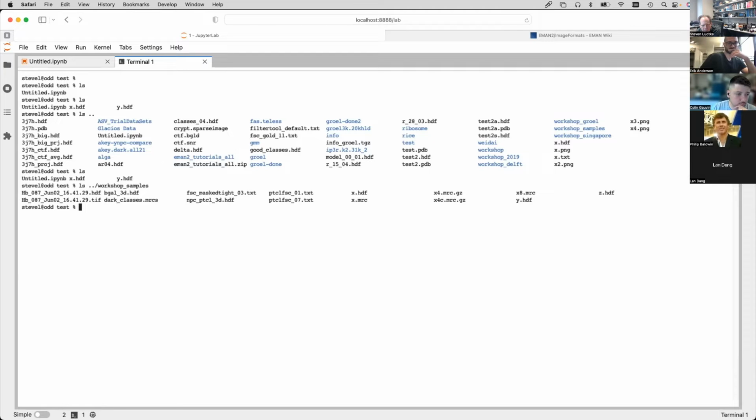I thought I had different file types there, but no, that's not actually very good. Oops. Where am I?